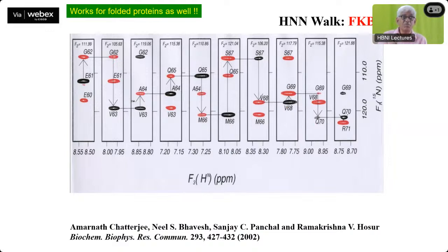You have the particular pattern of cross peaks in all of these, and that is important. The positive and negative peaks play an important role with regard to the way the sequence is laid out in the polypeptide chain. This is extremely useful as checkpoints. If you don't hit the right kind of peak pattern at a particular sequential position, then you know there is something wrong in your walk. By and large, it is very difficult to make a mistake here, because the chemical shifts and the signs are so clear that you can very rarely make a mistake.